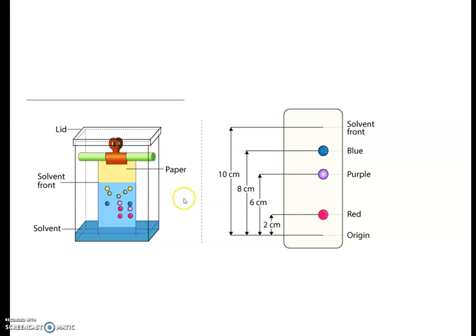So after some time, if we are putting a component which we have to separate out, sometime it will separate out like this with different layers. You can see after sometime different spots of whatever you want to separate. Maybe it may be colored components of leaves.